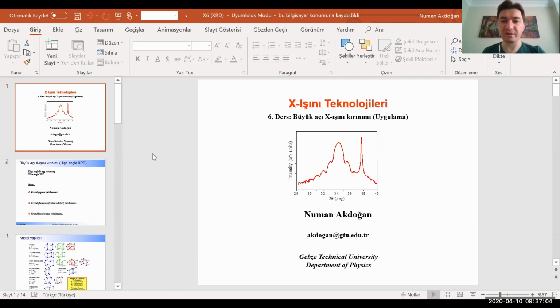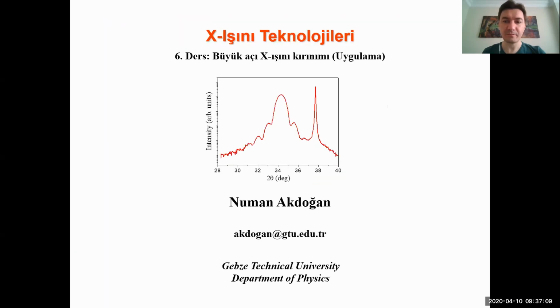Now we will give you some real examples of X-ray diffraction, and I will try to calculate the position of the peaks and Miller indices of the crystals. And we will also talk about in-plane X-ray diffraction and its difference from the conventional out-of-plane X-ray diffraction.